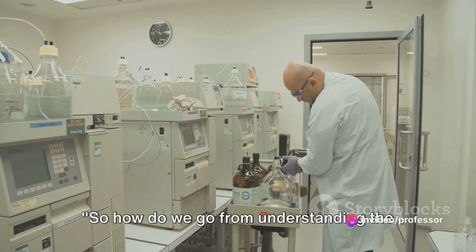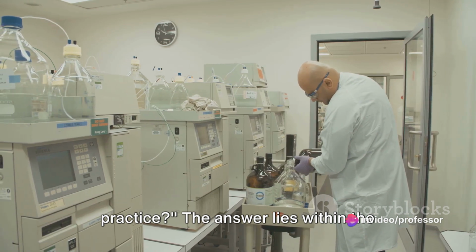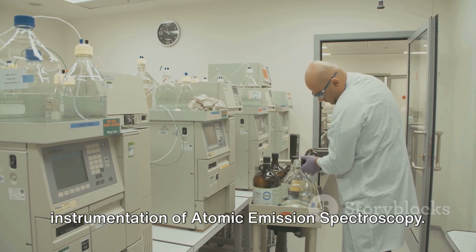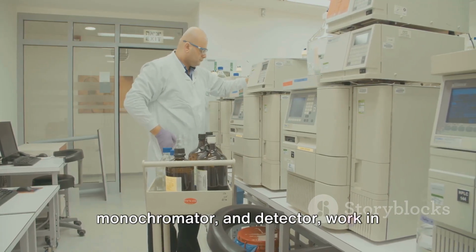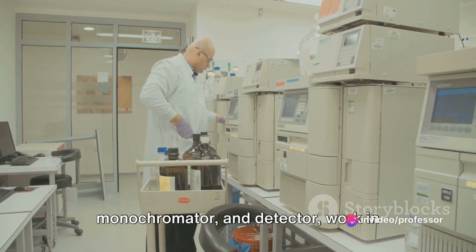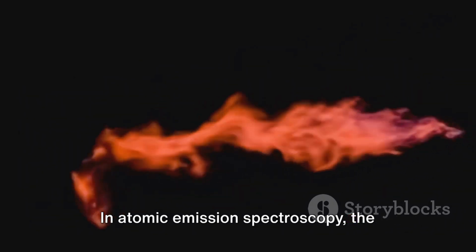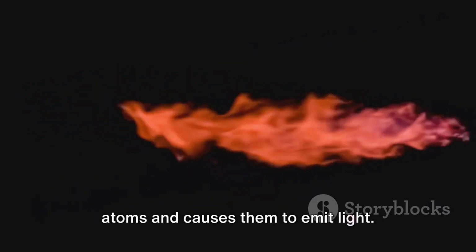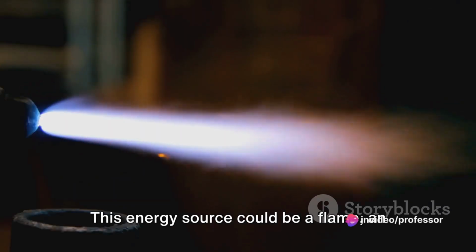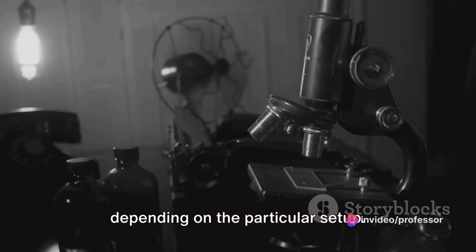So how do we go from understanding the principle to actually using it in practice? The answer lies within the instrumentation of atomic emission spectroscopy. These key instruments, which include the energy source, sample holder, monochromator, and detector, work in unison to create and measure atomic emission spectra. Let's start with the energy source. In atomic emission spectroscopy, the energy source is crucial as it excites the atoms and causes them to emit light. This energy source could be a flame, an electric arc, or a plasma source, depending on the particular setup.